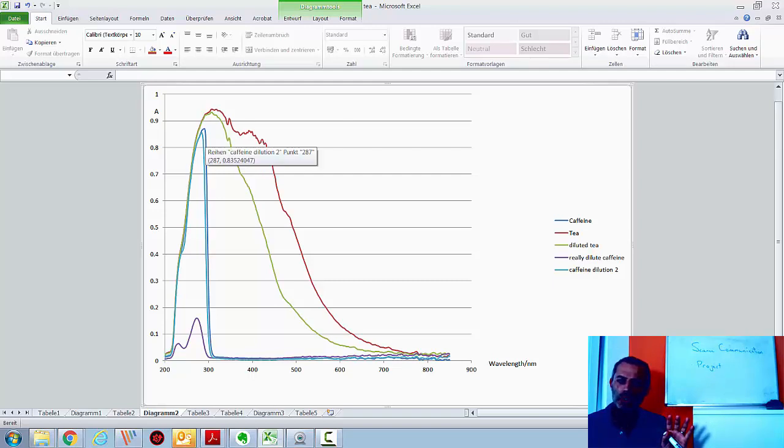But if I diluted it a very large amount, this was about a hundred times dilution, it got down and showed me this shape which looks like a proper absorption peak. So if we manage to get it down to here that's good and this is very good because this amount is about the amount in a cup of tea. We expect about 50 milligrams. So if we have to dilute it by a factor of a hundred that's good because then it means that we can measure it much more easily in our real solution.